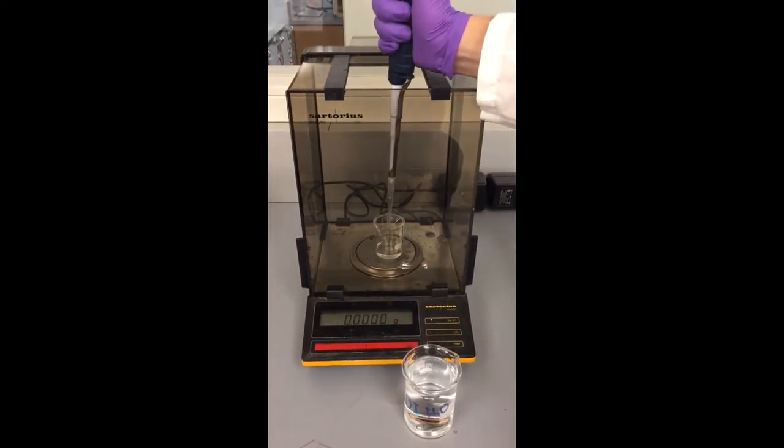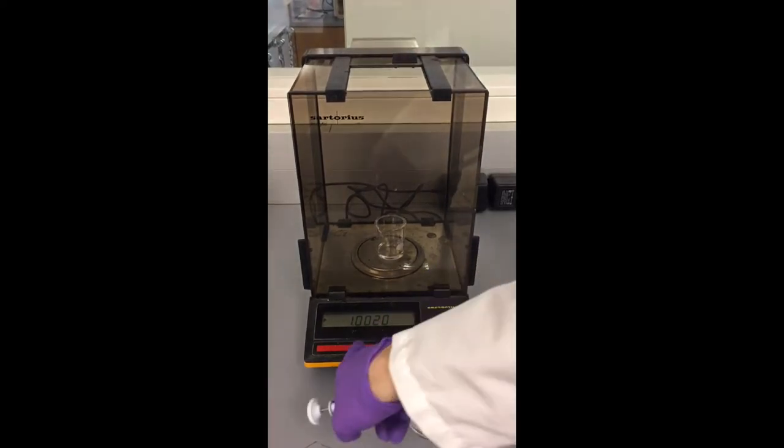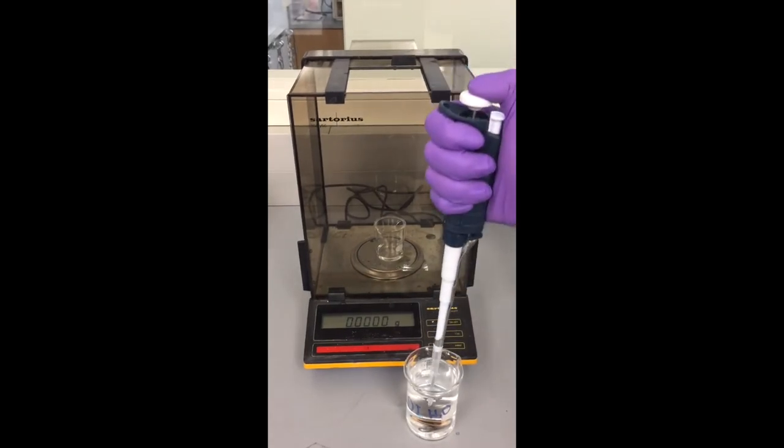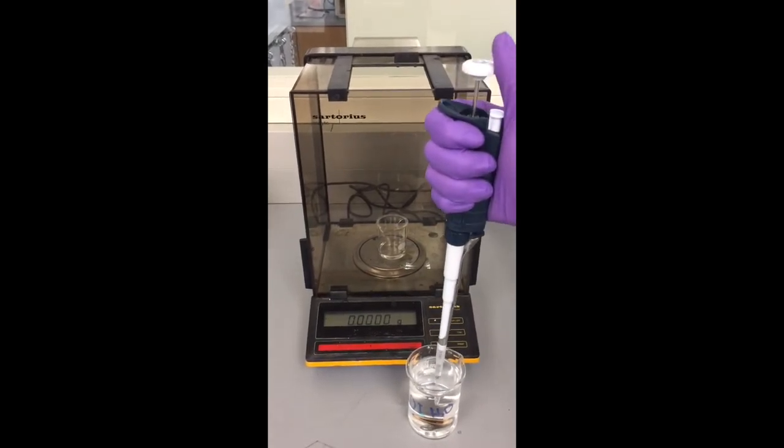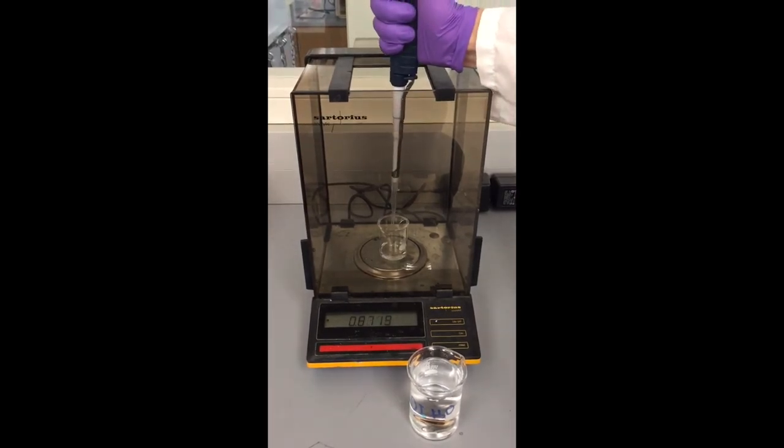For our calibration, we set the micropipet to 1000 microliters. You will need to repeat this step 3 times and make sure to zero the balance in between each time. If your micropipet is consistently more than 5% different than the expected weight of the water, ask your teacher for help adjusting your micropipet.